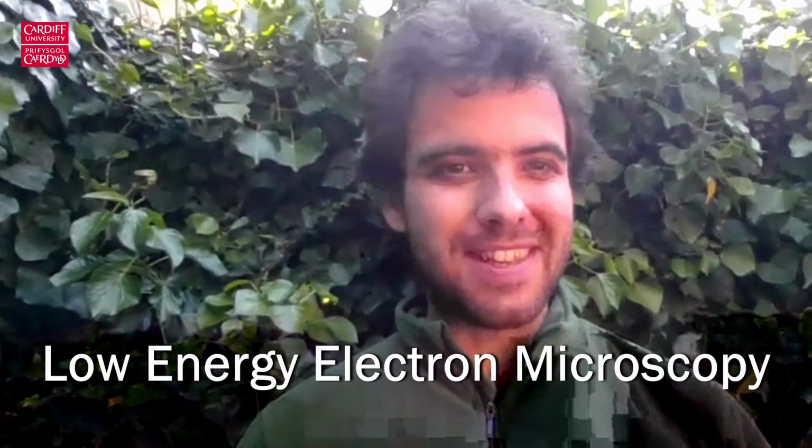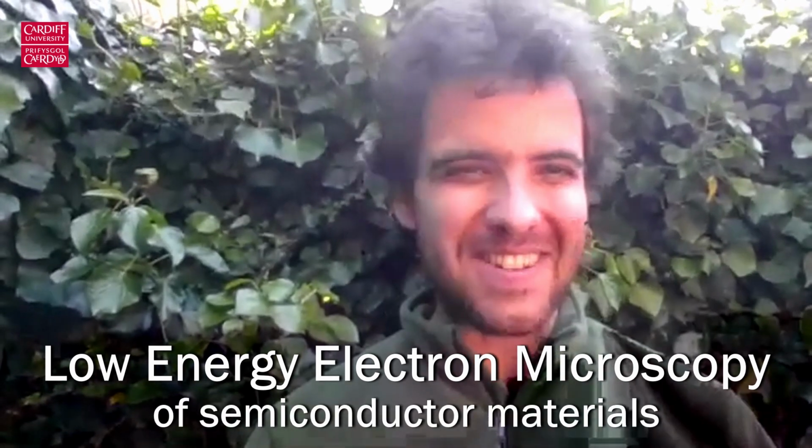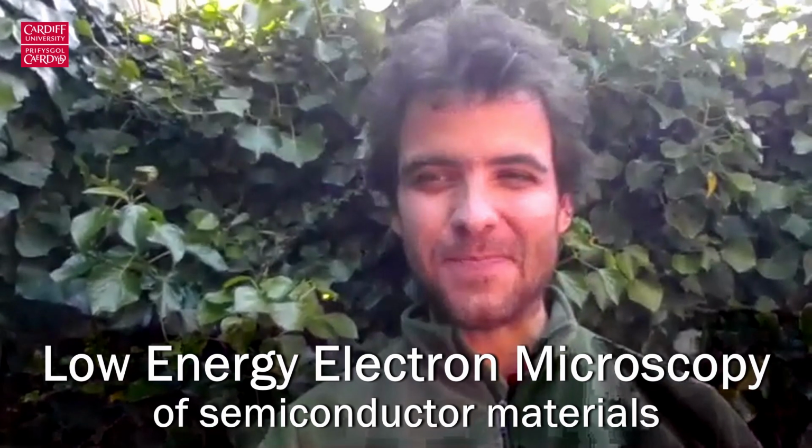I'm lecturing in Cardiff University, and I want to talk a little bit about my main research activity in Cardiff, which is the Low Energy Electron Microscopy of semiconductor materials. And I'll explain a little bit what this is about.